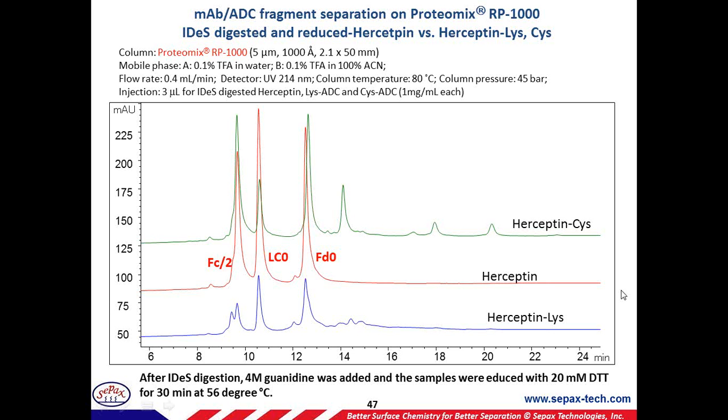Our charge variant study, we have talked about SCX and WCX, can really provide charge variant study for the antibody drug conjugates. The conjugate and the free mAb can be separated. Also, these different peaks need to be further characterized to really understand what's different there. The HIC phase allows the DAR calculation and the drug distribution analysis, especially for the cysteine ADCs. Right now, a lot of customers use HIC for lysine ADCs, you actually can separate unconjugated and conjugated, and there are different purposes there.